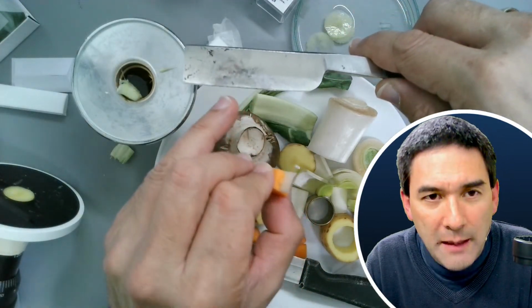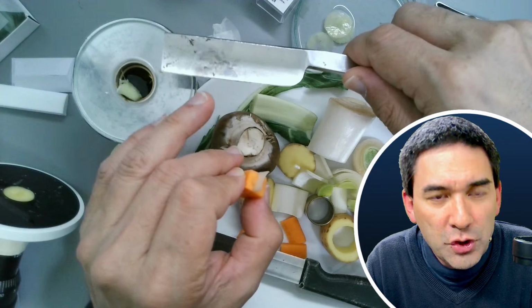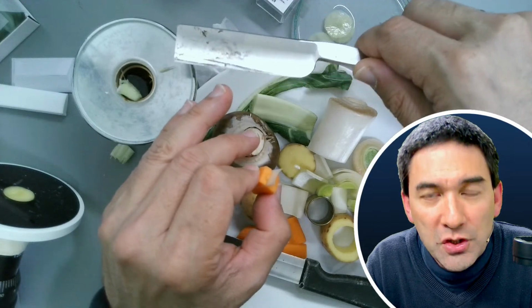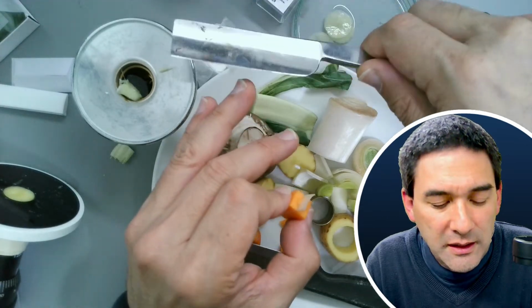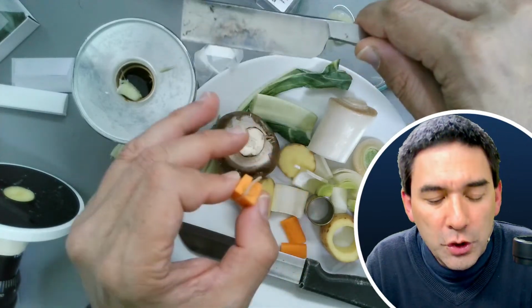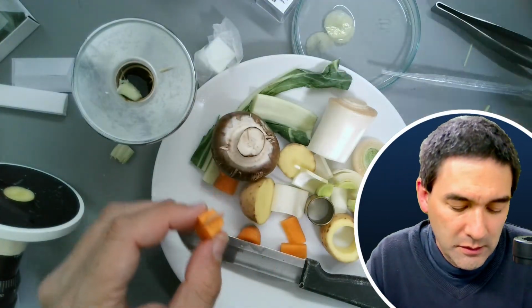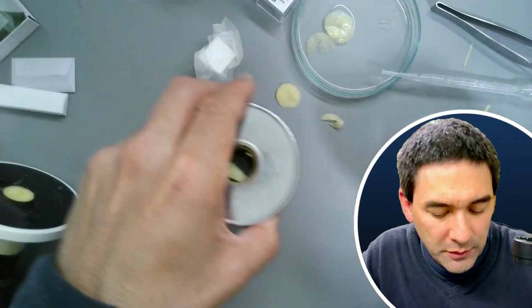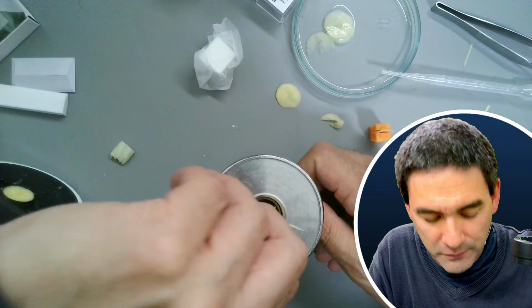As you cut through styrofoam, the friction is so high that the very front part of the knife's edge starts to melt, and this causes the knife to become dull very quickly. I think we're talking on an atomic level here, but styrofoam has very high friction, and this causes the knife's edge to become dull. For this reason, styrofoam is known to be very tough on knives, and therefore it should not be used. But then again, if you have a disposable knife, who cares really?